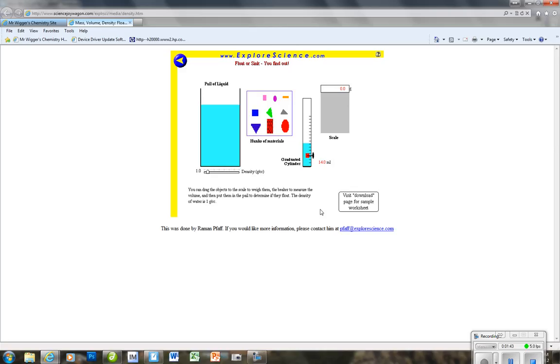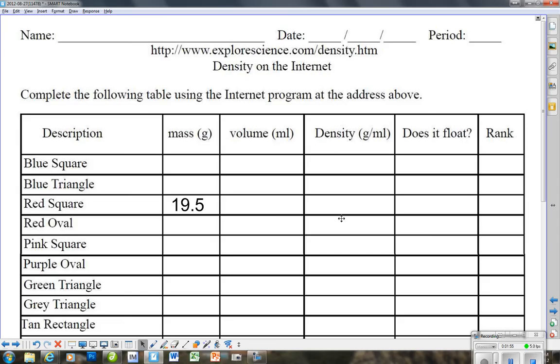The amount that it goes up is a total of 14 milliliters. That's the difference between the starting level which was down about here and the level that it's at right now. So that 14.0 milliliters is going in the volume column.